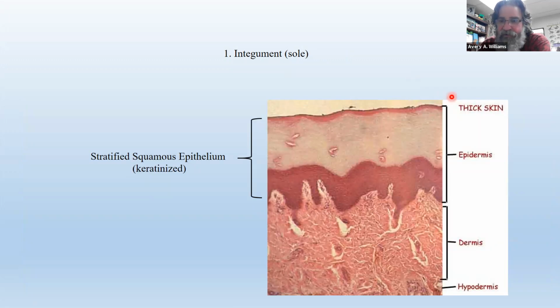All right, here's the epidermis right here, and it's made out of a specific type of tissue that covers and lines. All right, and covering and lining tissue is always called epithelial tissue. All right. Now there's different types of epithelial tissue. This particular type of epithelial tissue, since it's made out of thin, flat cells that are stacked on top of each other. Man, this is probably 30 or 40 cells deep. We say it's stratified. The stratified flat cells, stratified squamous epithelium. That's literally what it means, okay?